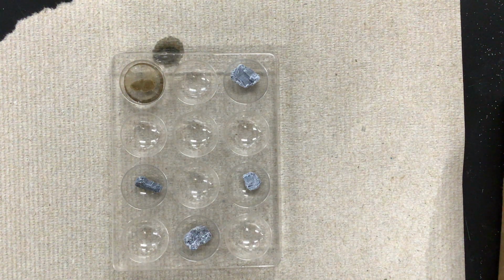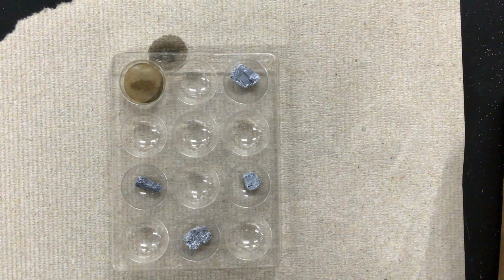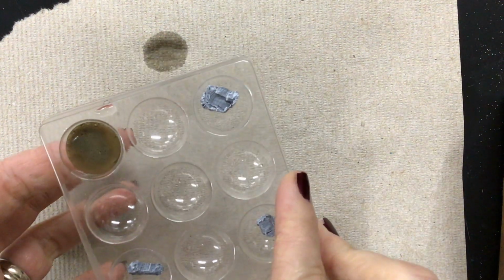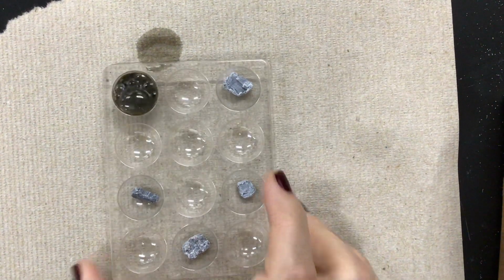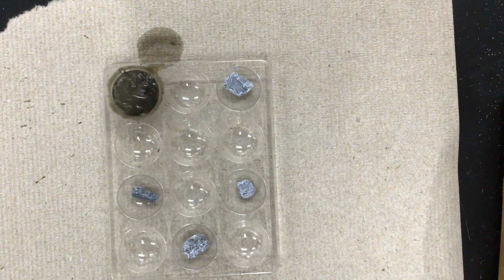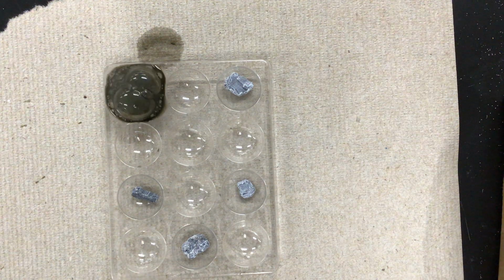And you can see right away that the calcium is starting to bubble up. There's a gas that's being produced. There was an unexpected color change because it got really, really brown. I don't feel a temperature change, but you can see how that got, ooh. Woo-wee, look at that. Took a minute to get going, but man, that's kind of violent.